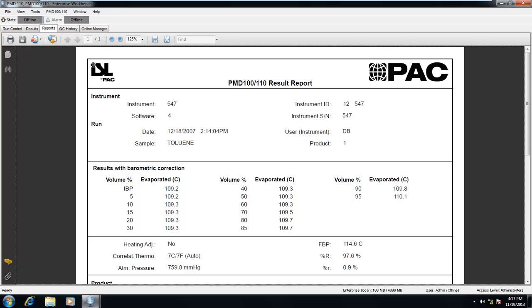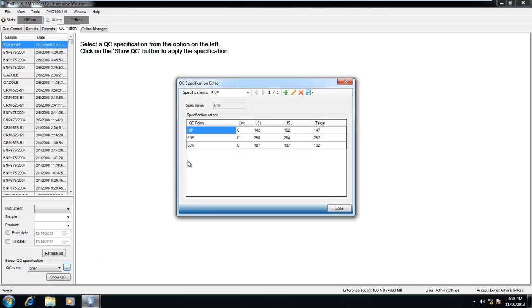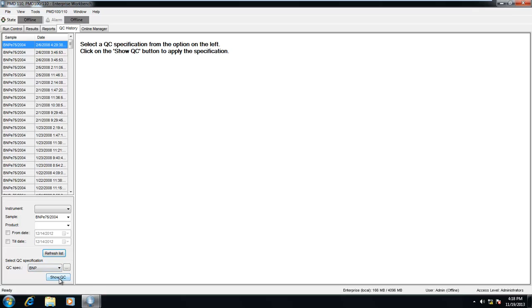One of the unique features in IRIS is its ability to quickly and easily generate QC charts. By clicking on the QC History tab, you'll notice a results filter similar to that used in the results tab. This allows the user to define what instrument, sample type, product, or date range they wish to plot results for. You'll also notice a box for QC specification, which defines an upper and lower limit as well as a target for the data point specific to this instrument type — in this case, IBP, FBP, and 50%. Once we've entered this data, we can filter our results by a specific type or instrument, refresh the list, select our QC specification, and show our QC.